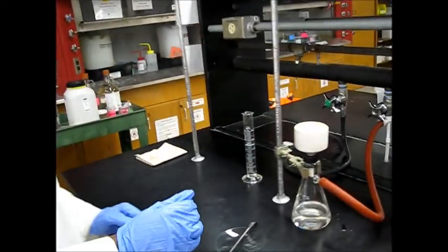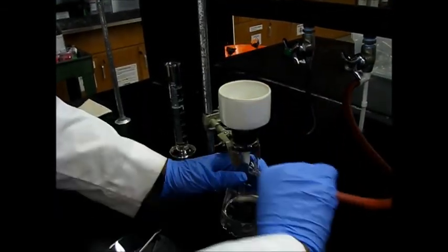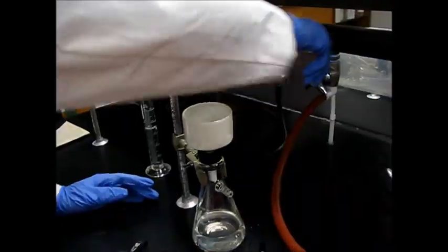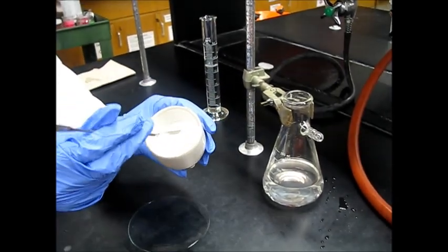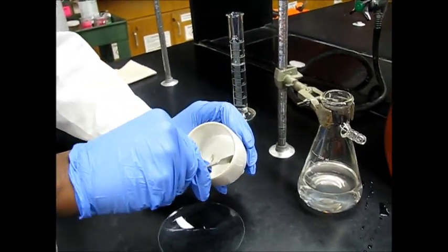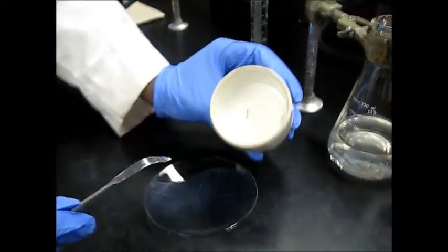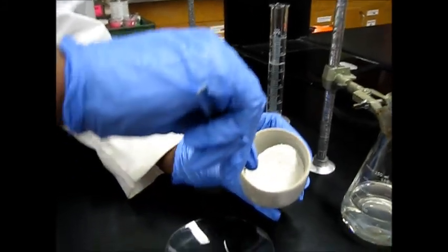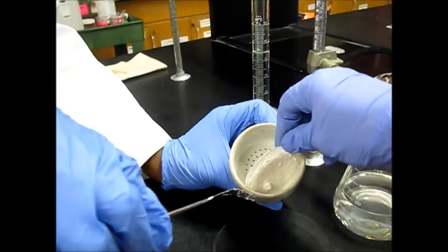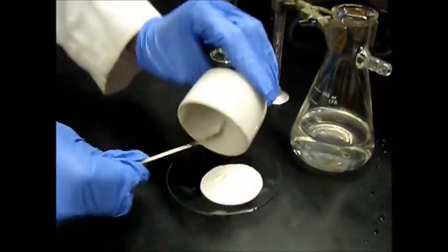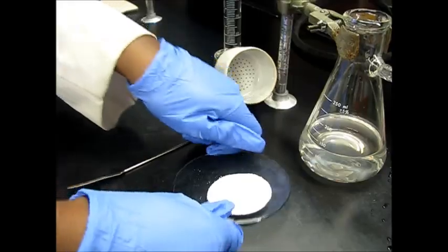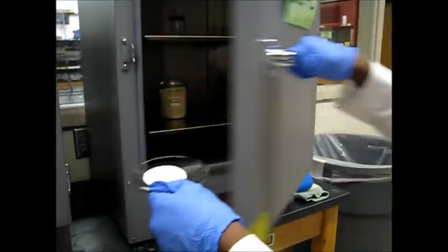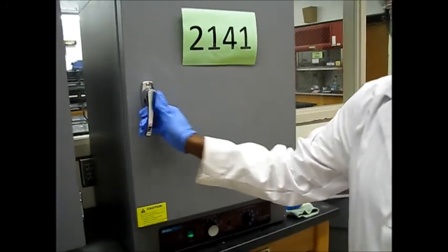So now we're going to stop our vacuum filtration. We're going to remove the hose. Now we're going to get our product. We're going to use our spatula. We're going to scrape around the edges and lift up the filter paper. Try to get all of our product. And then we'll oven dry. Now we're going to oven dry our product just for 10 minutes. And we'll come back in 10 minutes.